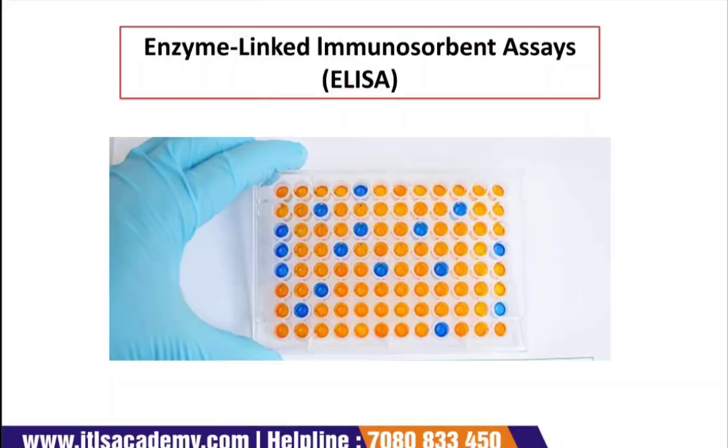First of all, ELISA stands for enzyme linked immunosorbent assay, and it is one of the most widely used contemporary methods in the food industry. So what does ELISA do? The ELISA method detects the actual allergen protein molecule. How?